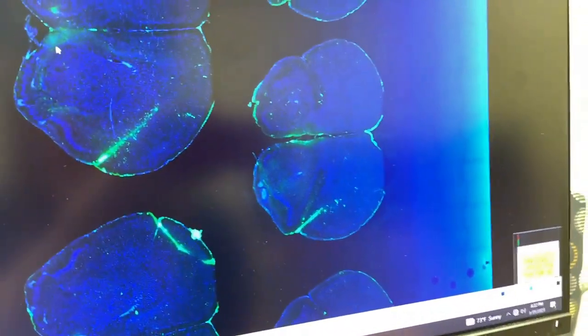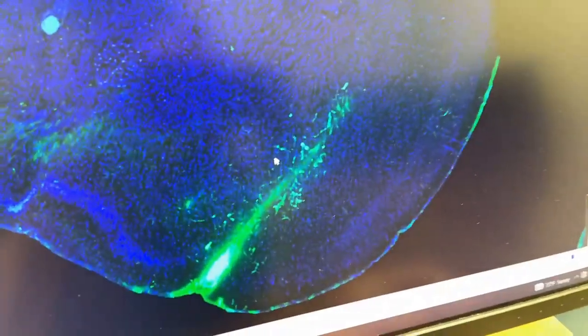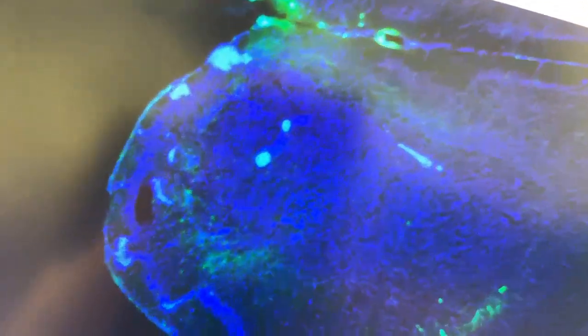Mostly. I'm just trying to see which of these I'm gonna have to redo. That's in focus. This is... I don't know what this is. I amplified the GFP, and I feel like this is just some gross artifact.